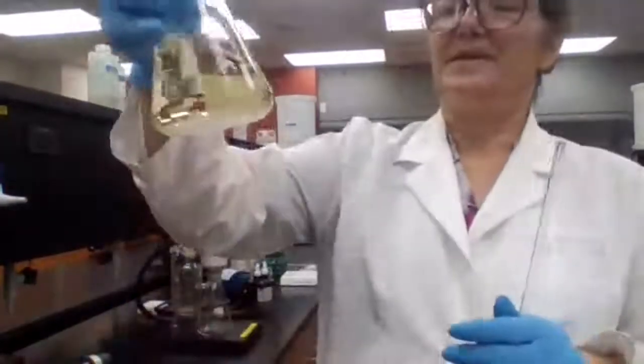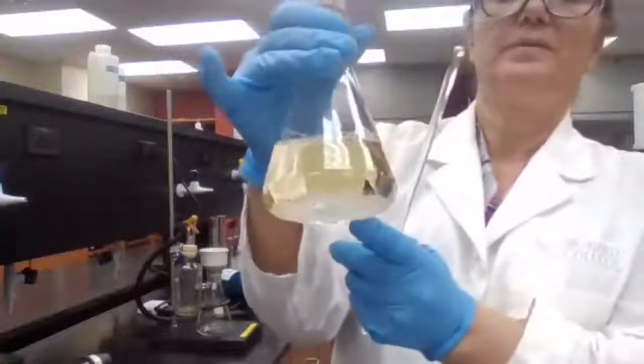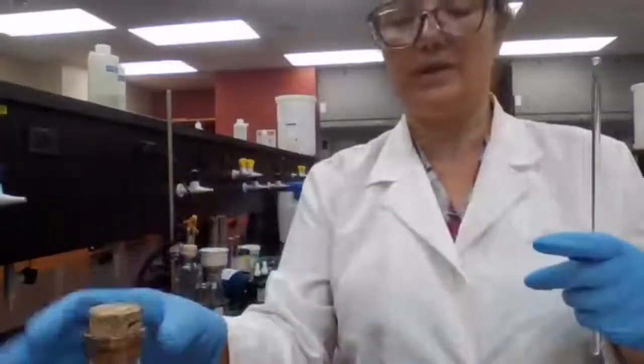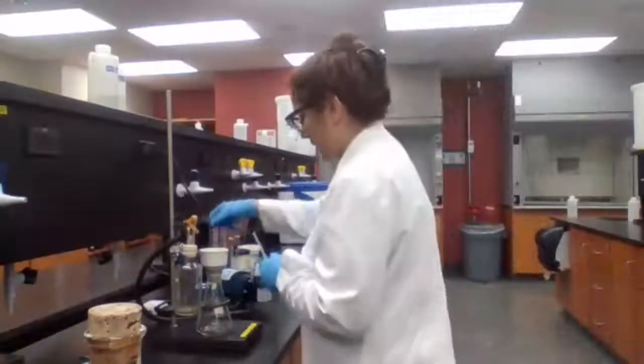Okay, we have the crystals from the other day. The crystals are formed, and I'm going to collect them following your procedure. I need to collect the crystals with vacuum filtration.